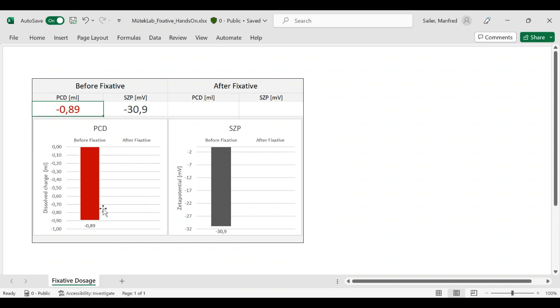And you can also name this red column here the problem of the suspension. Because as you have heard from Todd, this anionic trash is present in dissolved form, which makes it highly reactive. So whatever cationic additive you would be dosing into the suspension, this charge here will be the primary reaction partner.